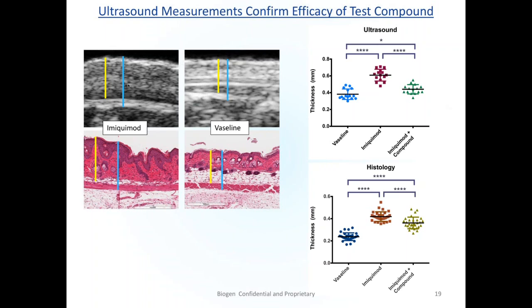So there's potential for distortion, for the tissue to look a little bit different than it might have looked on the living creature. I don't know if this would always be representative. It's possible that this is, you know, this difference.